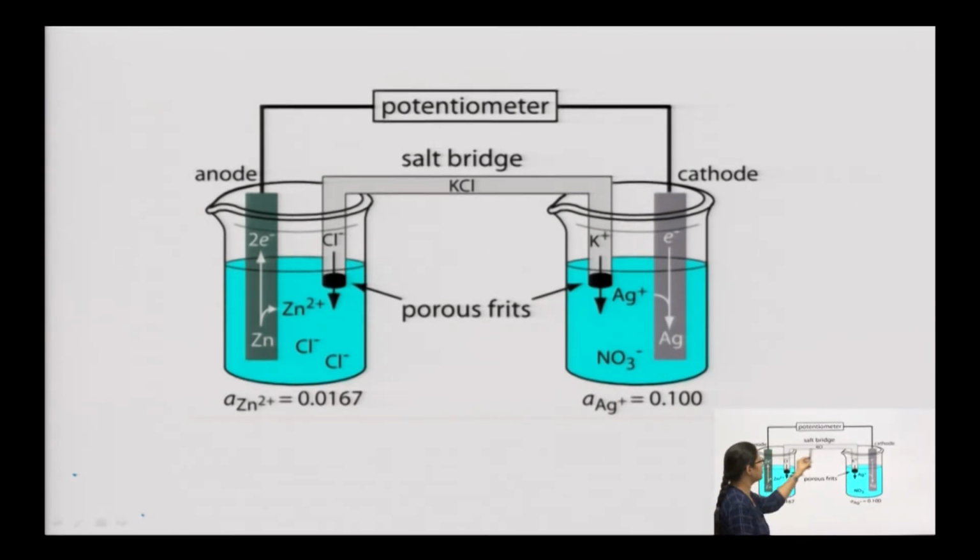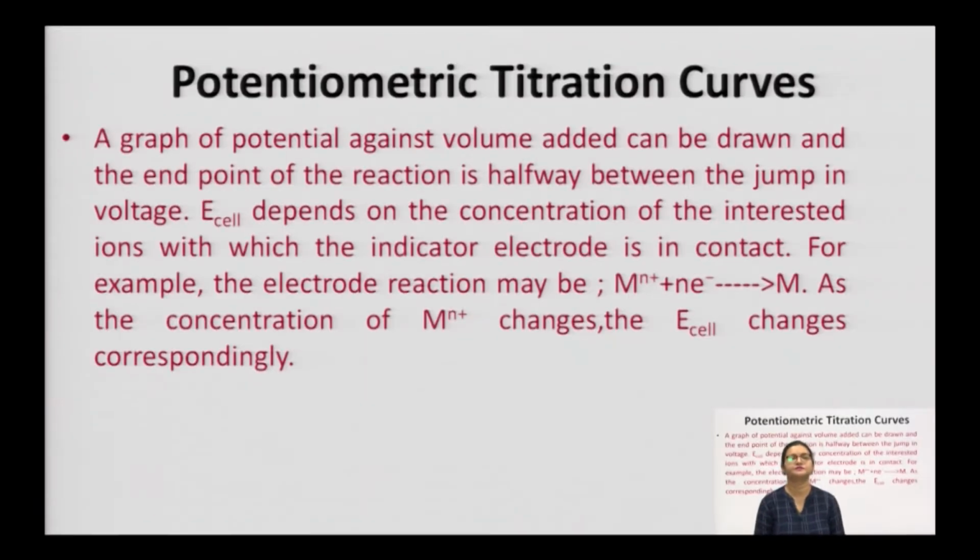And this is a salt bridge. What is a salt bridge? We will study it further in our coming slides.